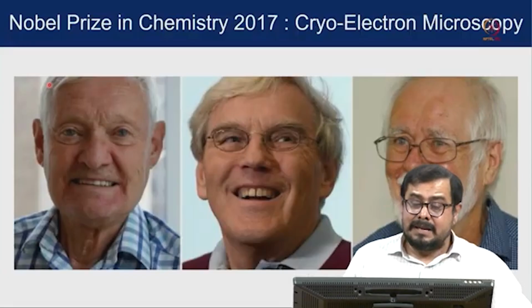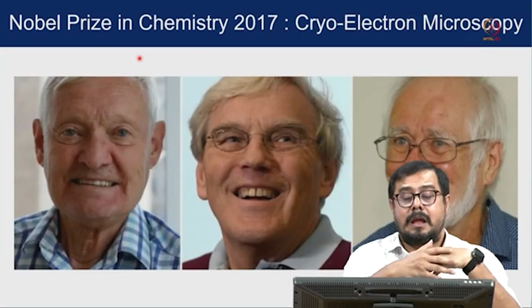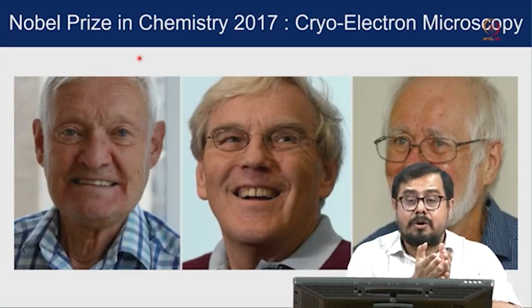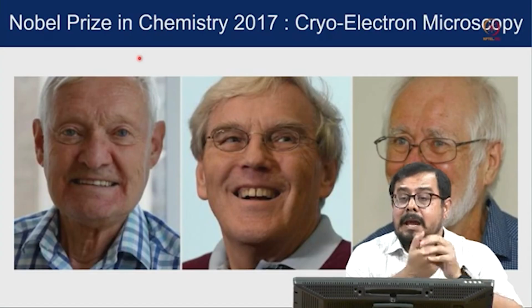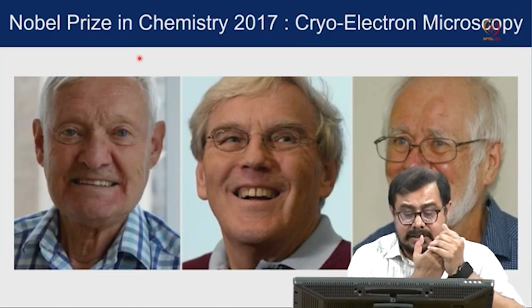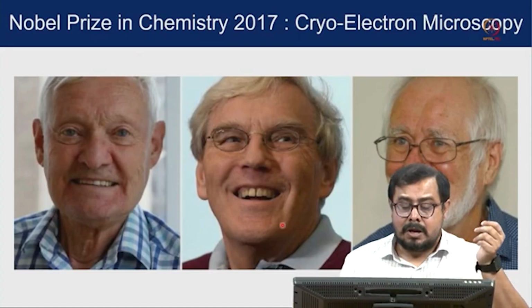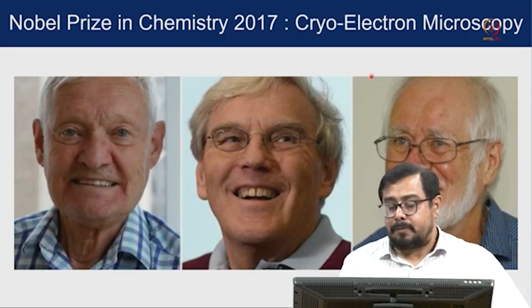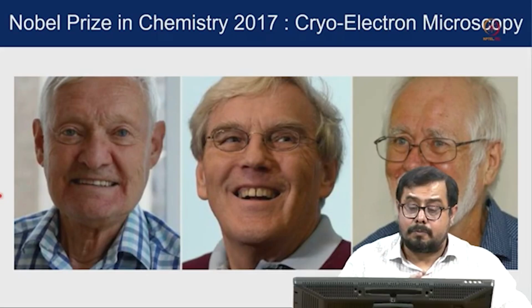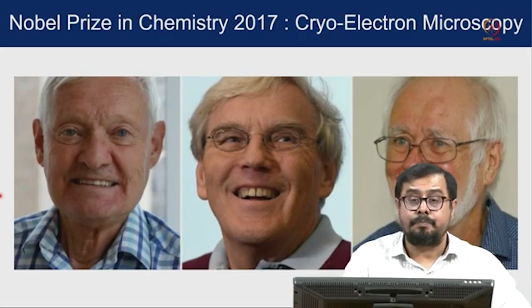Now, in chemistry in 2017, cryo-electron microscopy got the Nobel Prize. The three famous scientists, Professor Richard Henderson, Professor Jacques Dubochet, and Professor Joachim Frank, got the Nobel Prize in 2017 for the development of the cryo-electron microscope.